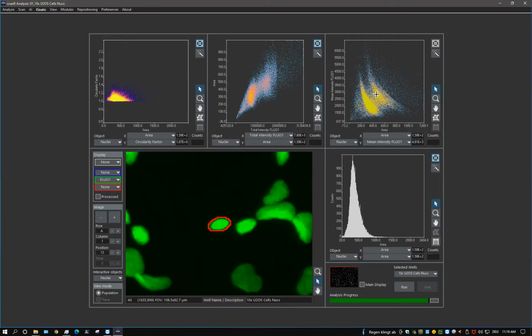And I can easily measure them. The measurement is based on what I show here. I show the segmentation and the exploration of the data. The measurement is the not so interesting step, which is more the routine work afterwards. It can also be defined in the assay, but I don't want to show that here.